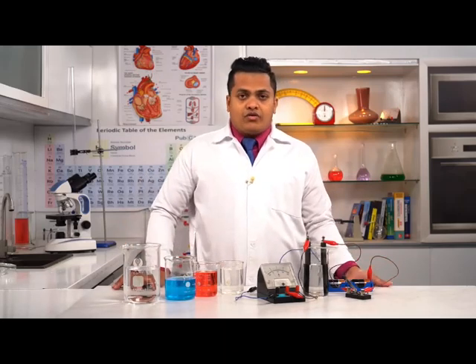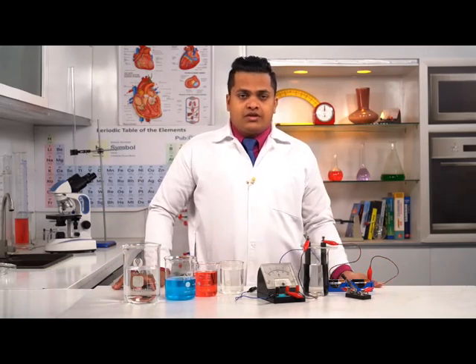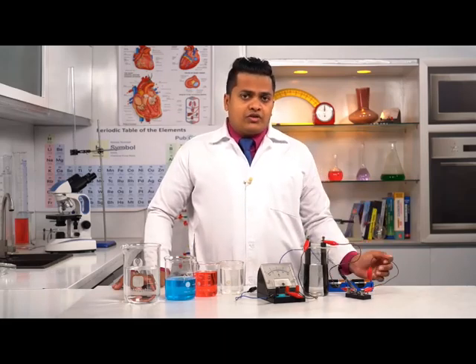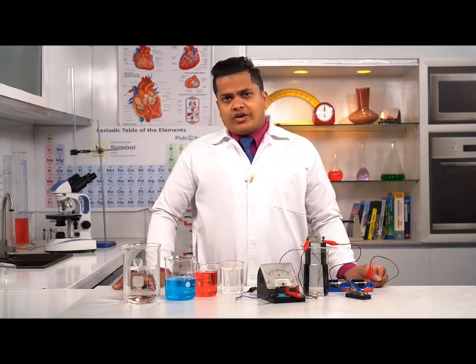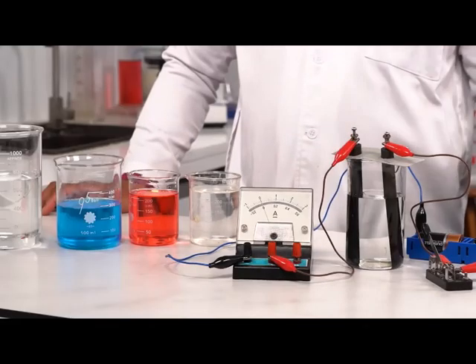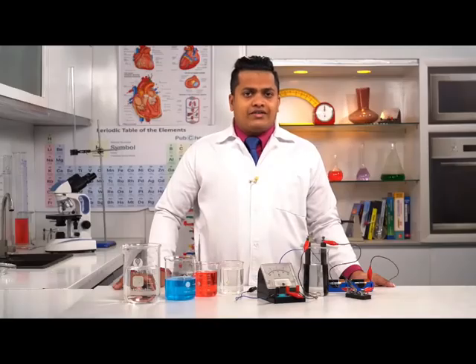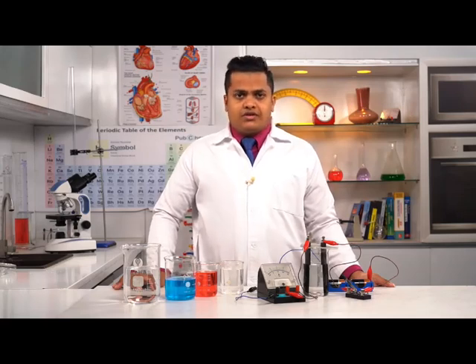Now what we are going to do here is dip these two electrodes within each of these solutions. After that, by turning the switch on, we are going to see which solution is going to conduct electricity and which one is not. If the solution conducts electricity, my dear children, the ammeter reading will deflect in a certain direction. That will indicate that the solution carries electricity from one place to another, from a higher potential to a lower potential.